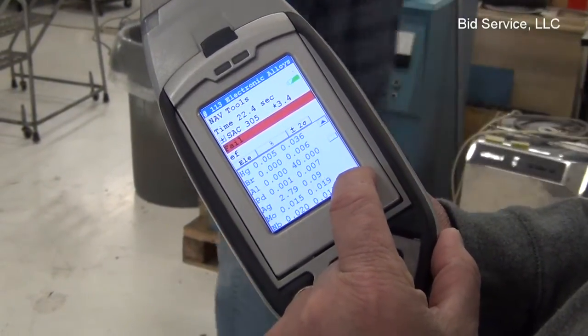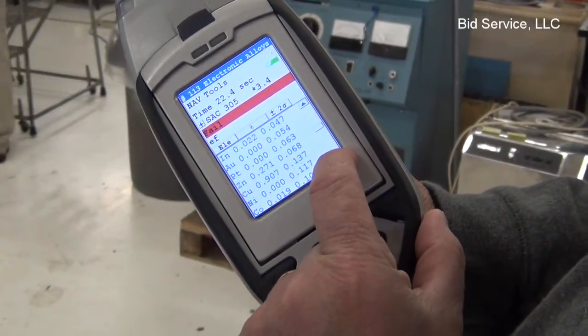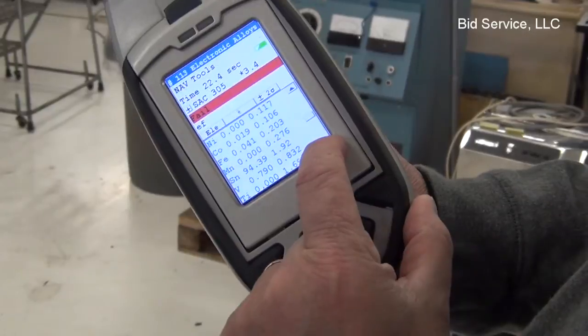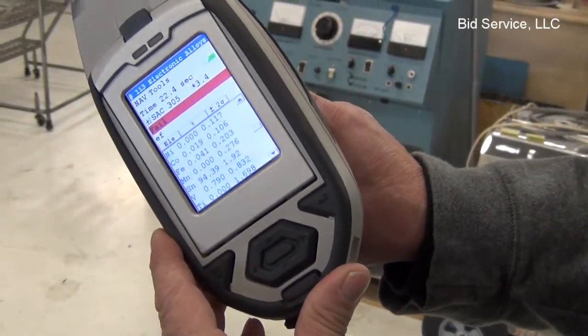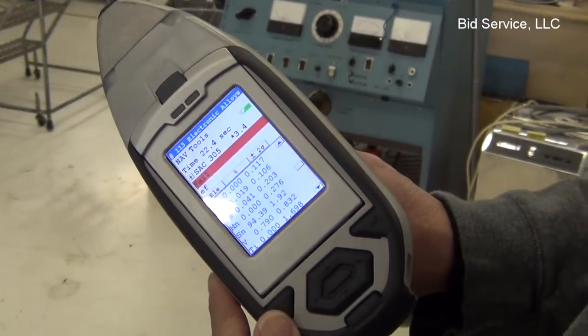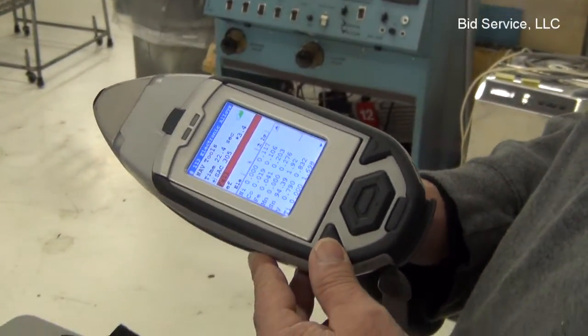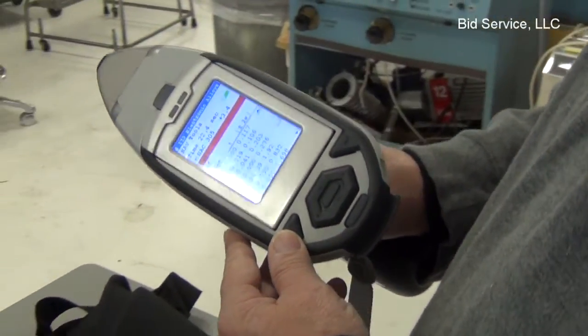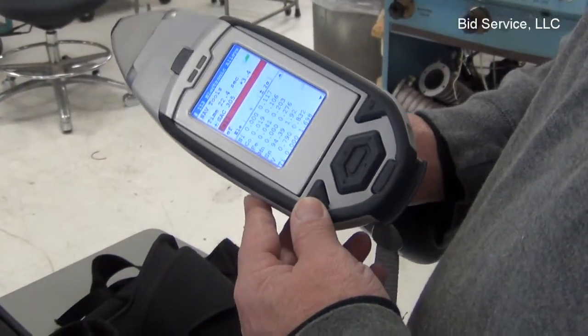This is a mostly tin alloy, and as you can see, it's 94.39% tin, with all the other trace elements included in it. This will work on many different alloys and plastics, but it does not have the lead feature for paint.